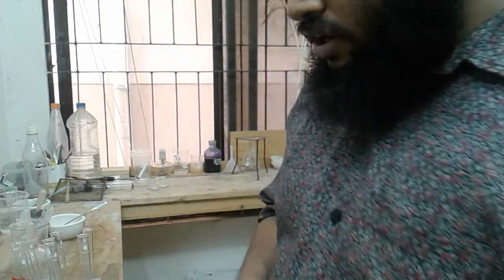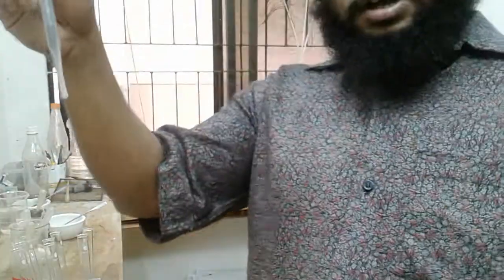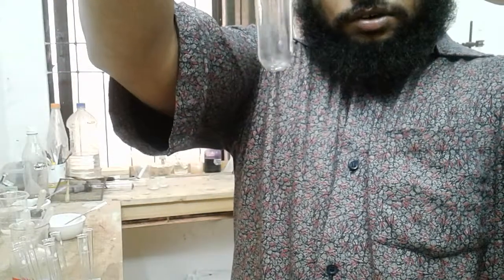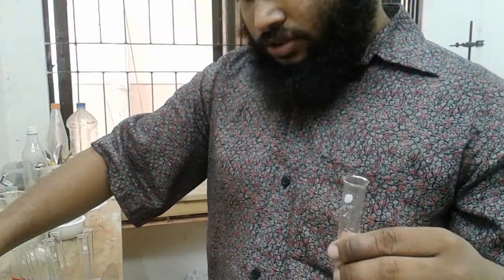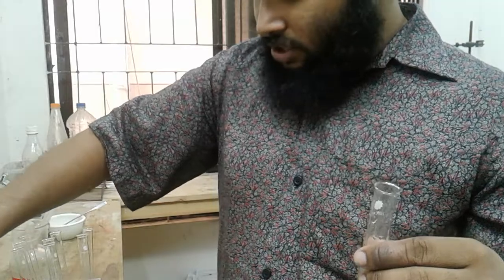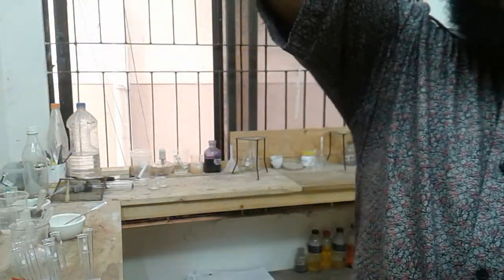Where is Fa1B? Oh, here it is. So I am taking 1 centimeter cube depth of Fa1B, and then I am adding sodium hydroxide until no further change. That means again no specific amount is mentioned.